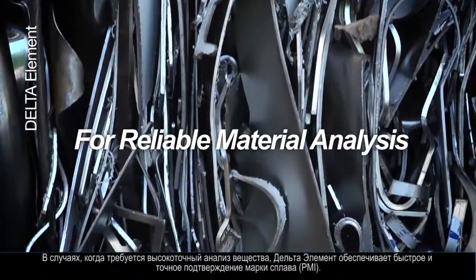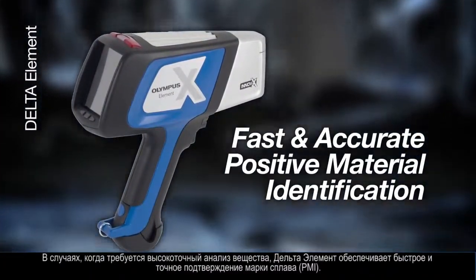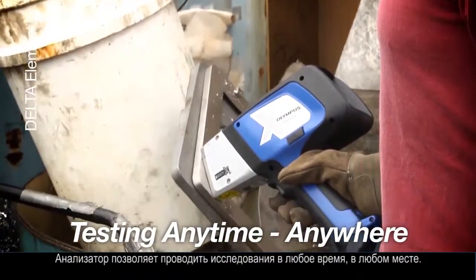When reliable material analysis is required, the Delta Element provides fast and accurate positive material identification. The Element allows testing anytime, anywhere.